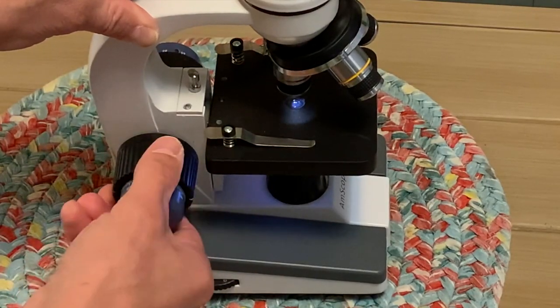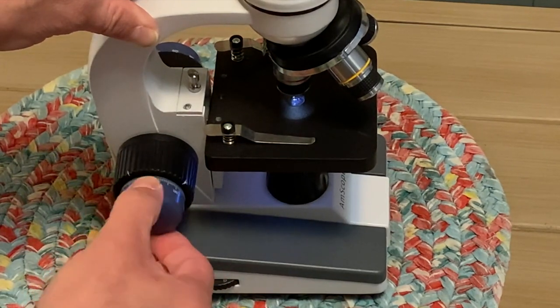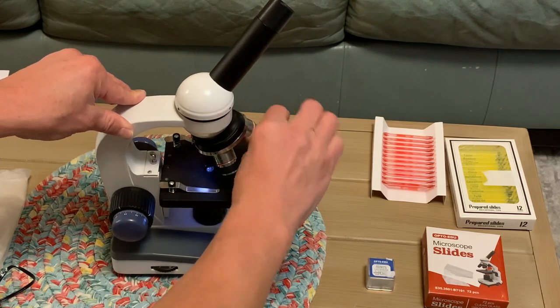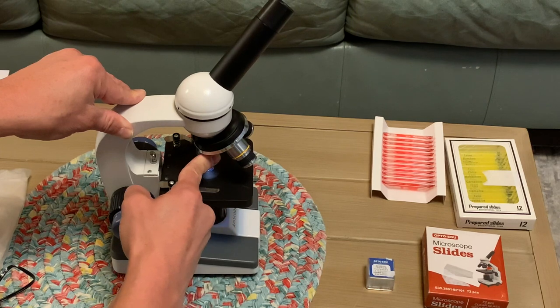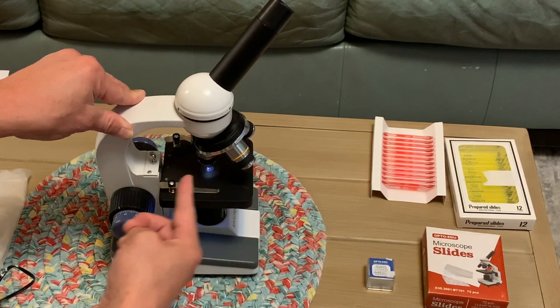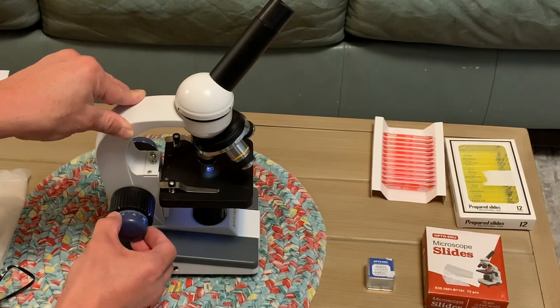This large black knob is for your larger changes in focus and this gray knob is for your more fine changes. If you're looking at something you always want to start with the smallest magnification of 4x, and once you've got your slide in focus clearly then you can move up in magnification and do slight adjustments to see more clearly.